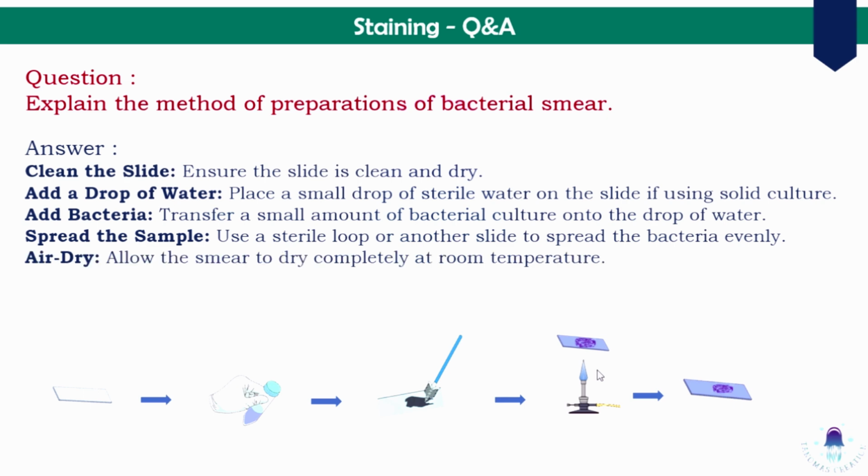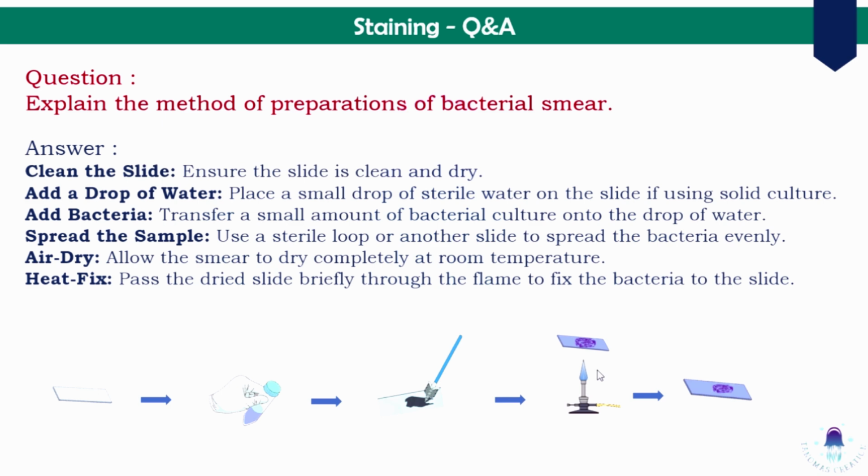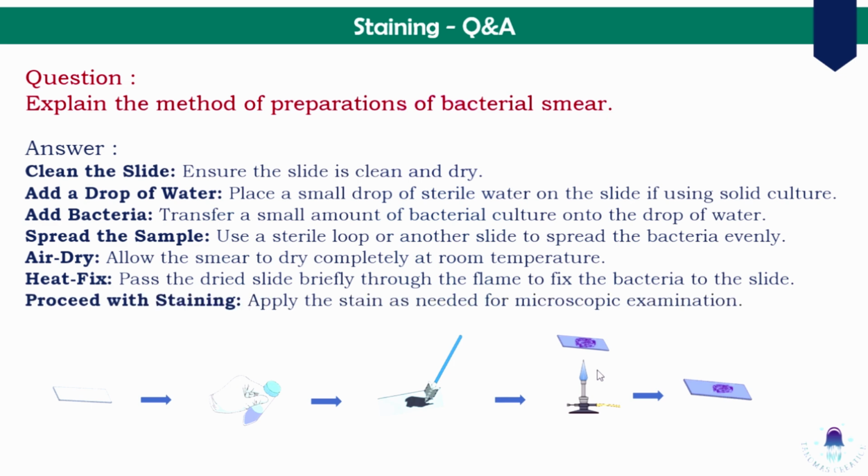Air dry. Allow the smear to dry completely at room temperature. Heat fix. Pass the dried slide briefly through the flame to fix the bacteria to the slide. Proceed with staining. Apply the stain as needed for microscopic examination.